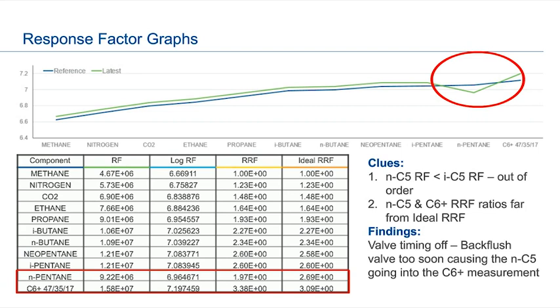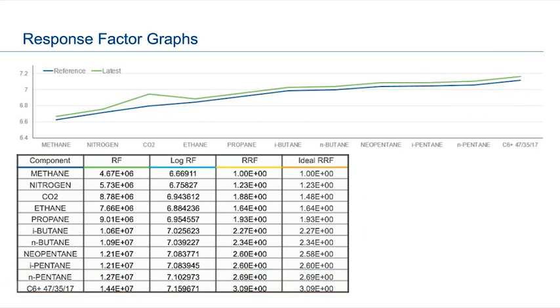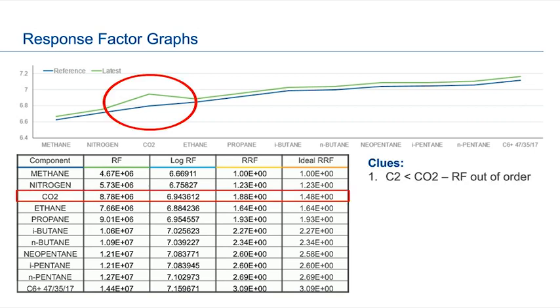In this case, the CO2 is higher than expected. It didn't shift correctly. It's out of alignment. So if I look at that, I can definitely tell my CO2 is higher than my ethane, so it's kind of off a bit. But everything else looks good. So I don't have an issue with one of the other numbers. So my CO2 is out.